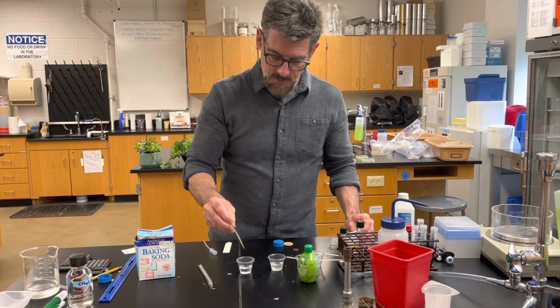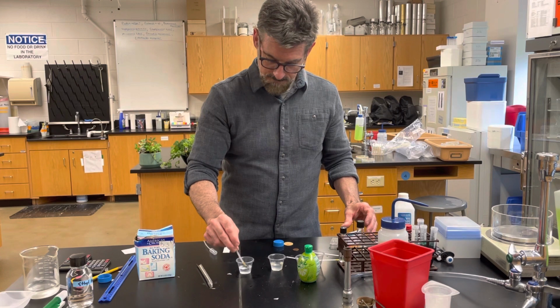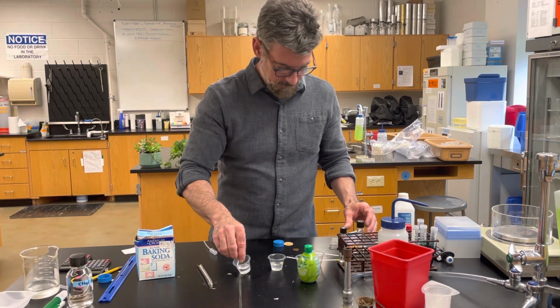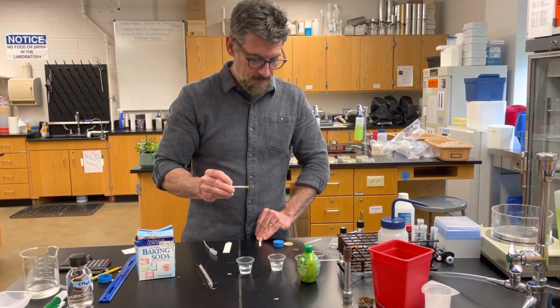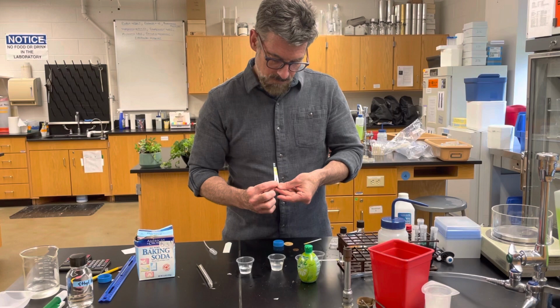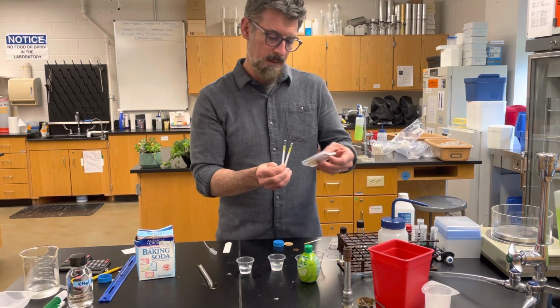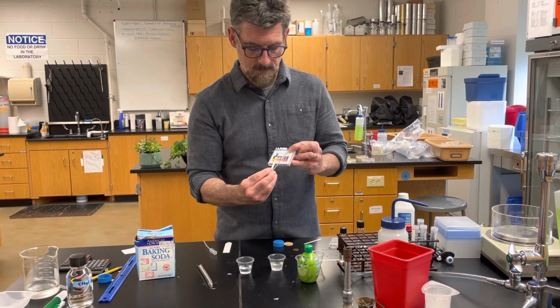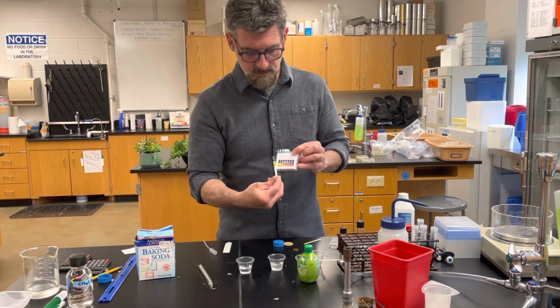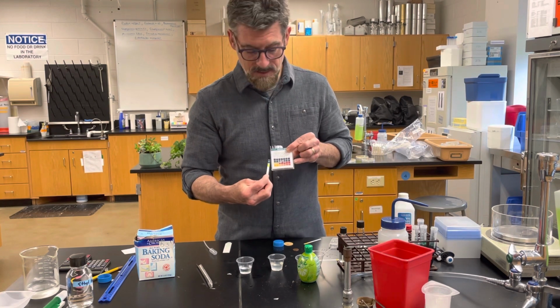We'll take another strip. Now I'm putting this one in the one that I had baking soda. All right, we're seeing the difference here. Again, this is what it was originally with the pH 7. And now you can see with the baking soda, I'll just get rid of the one because it makes it too hard. It's getting closer to probably the pH 8. Maybe between the pH 8 and 9, you kind of can see here.